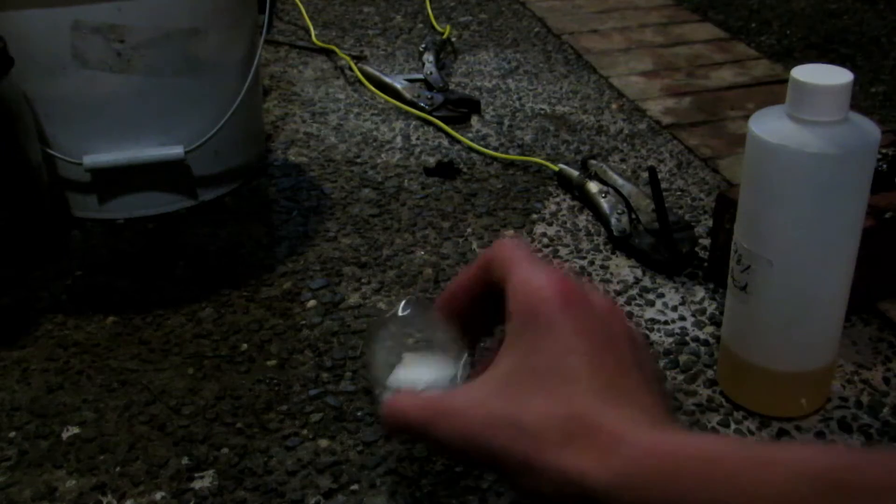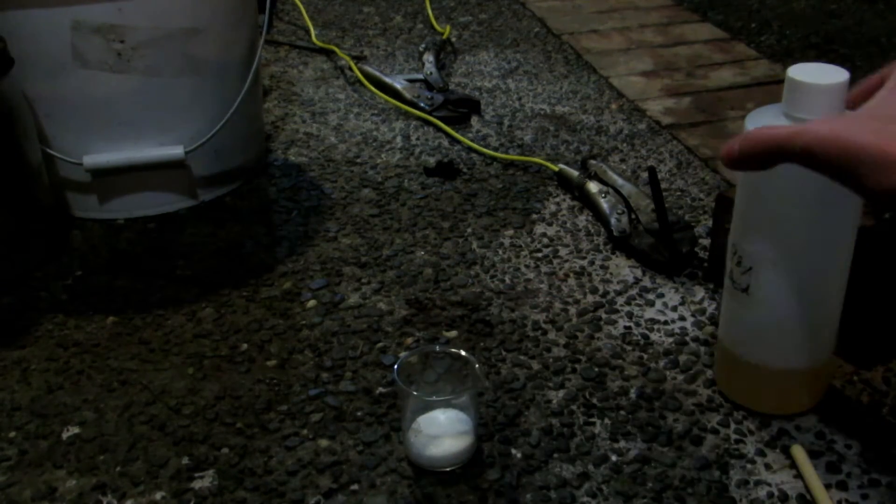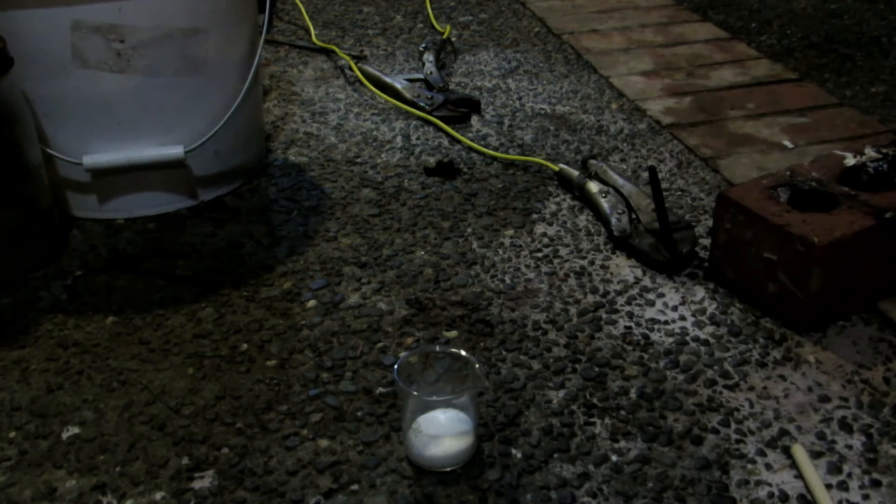I have exactly 10 grams of sugar here, just regular table sugar, and some concentrated 98% sulfuric acid which is slightly yellow due to impurities. We actually distilled this in a previous video. It's slightly yellow because there was some extreme bumping and some impurities from the boiling flask came over and discolored it, but it's relatively pure — pure enough for almost every application. You can check that video out on how to distill it.